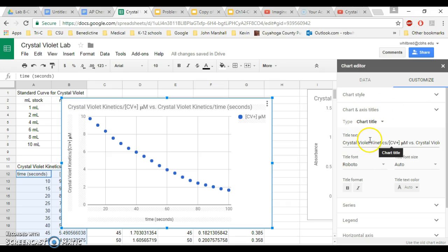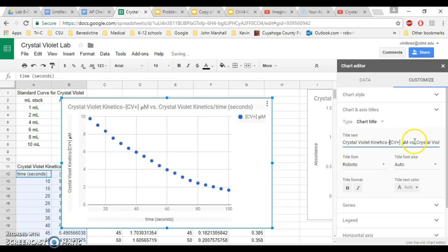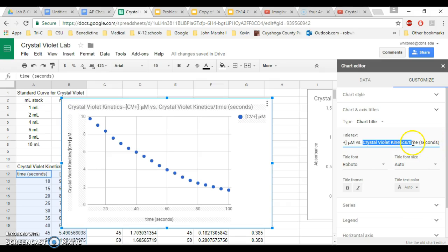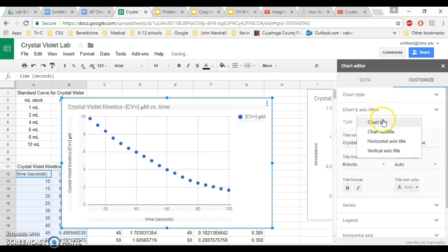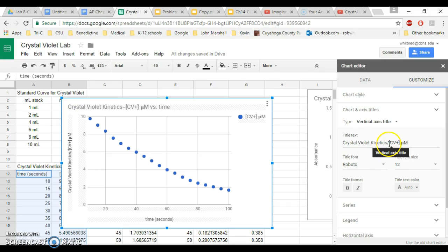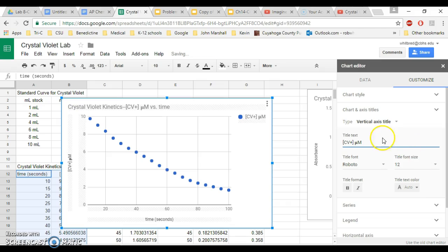Then you're going to go under horizontal axis title. Let's go under chart title and look at this. Crystal violet kinetics, CV micromolar versus time. And then you're going to go under your vertical axis title, and for your vertical axis title you only need CV and micromolar.